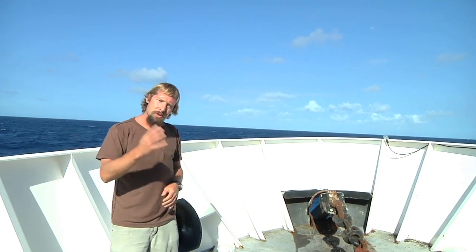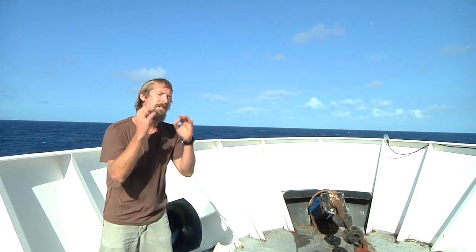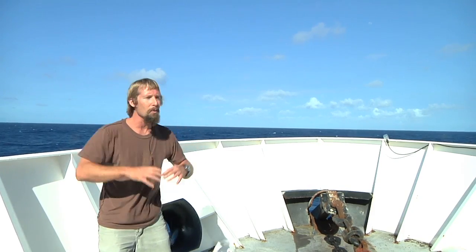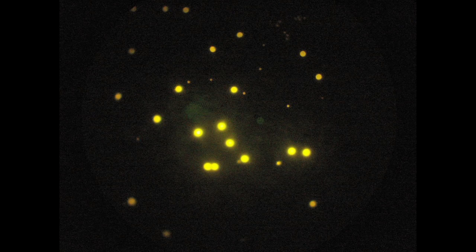While we're at sea, the students broke up into 4 main groups. I was fortunate enough today to follow along with the visualization group. What is this group doing? Well, they're actually trying to visualize marine microbes, the stuff that you can't see with the naked eye. I mean, it's amazing. This water is so blue, yet it's teeming with life.